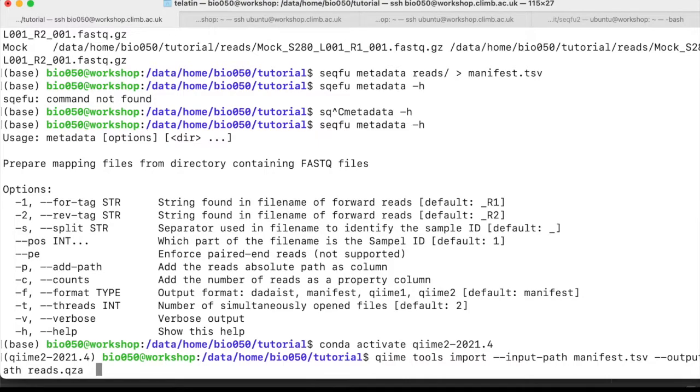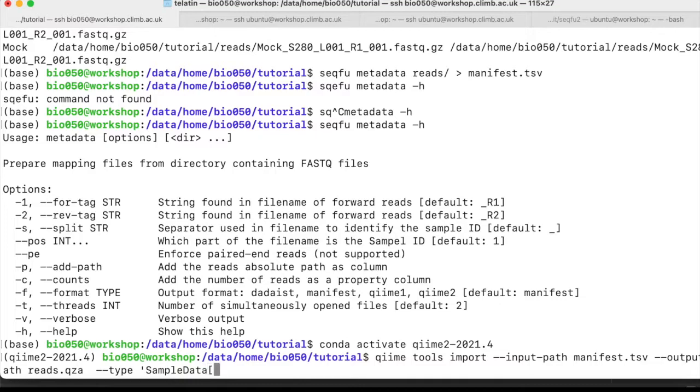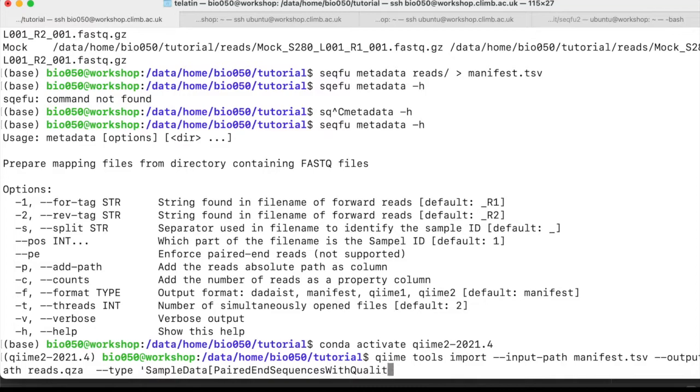Again, --output-path, the output manifest. Again, we need to specify a type and a format. So --type. In this case, it would be SampleData, as before, paired-end sequences with quality. The exact very same type, because this is it.